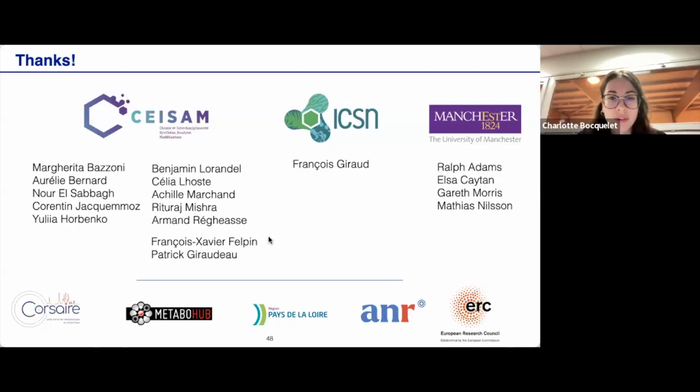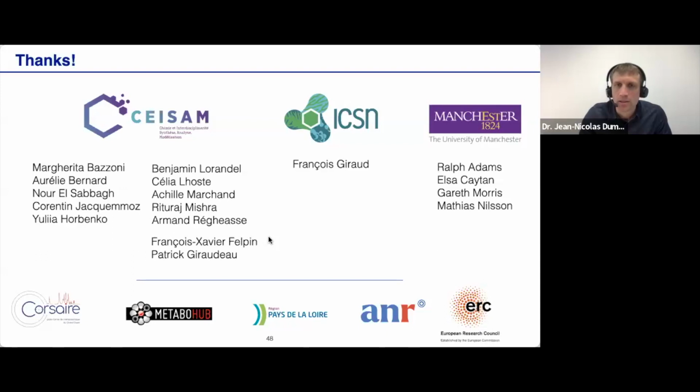We have a question from Andrew Ho. In some flow NMR systems, the flow is bidirectional, with the capillary delivering reagents into the tube. Do you expect the same improvements with the double encoding transverse gradient pulses when the flow is in two directions? I would say yes. In fact, I think I didn't even mention it, but we're working with a commercial InsightMR system by Bruker that has such bidirectional flow. There's the capillary going to the bottom of the tube, and then the sample going up.